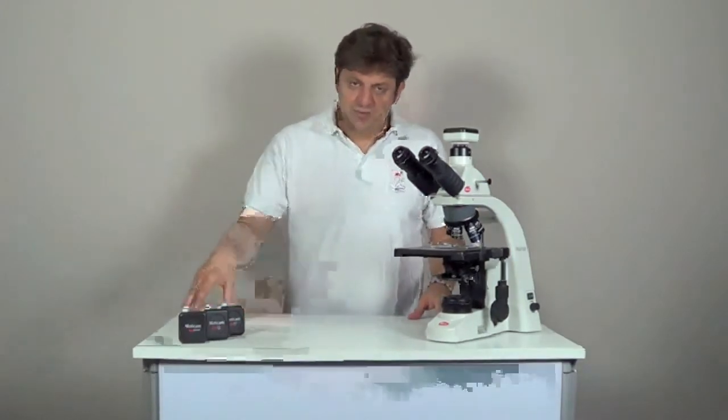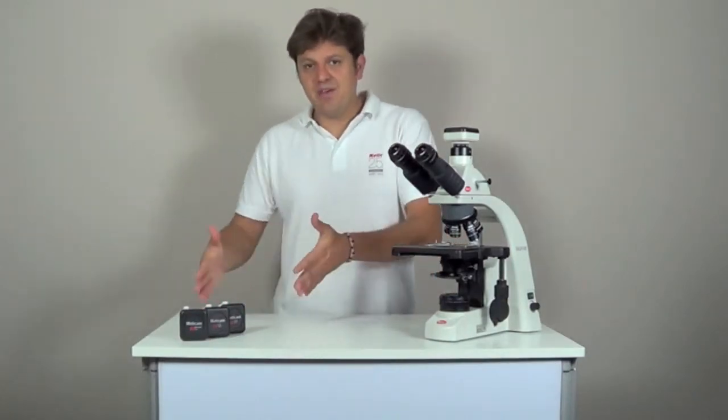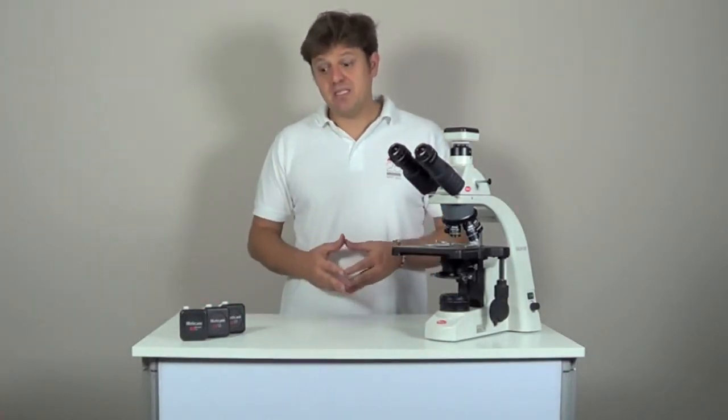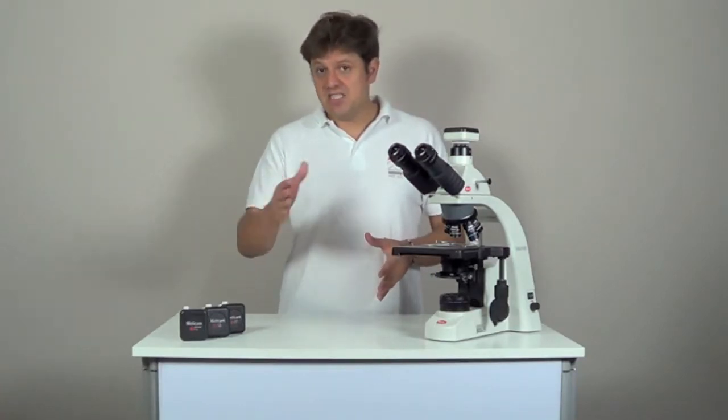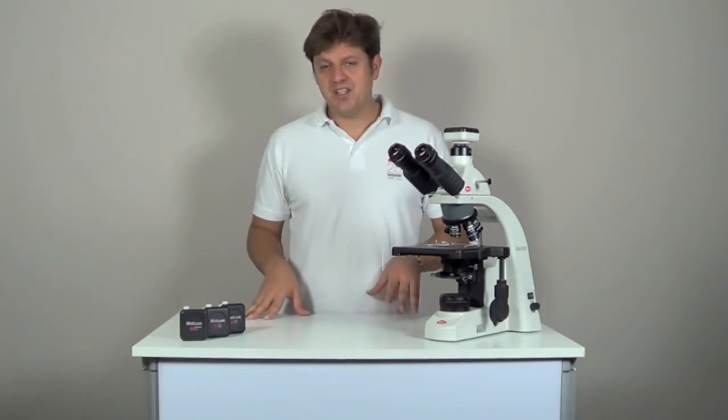Maticam 1SP has a resolution of 1.3 megapixels, more than twice as much as the Maticam 1. The advantage of this model is that most laptop screens also have a resolution of 1.3 megapixels, which means that the whole image is completely displayed on the screen. It is a very popular model in the education sector.